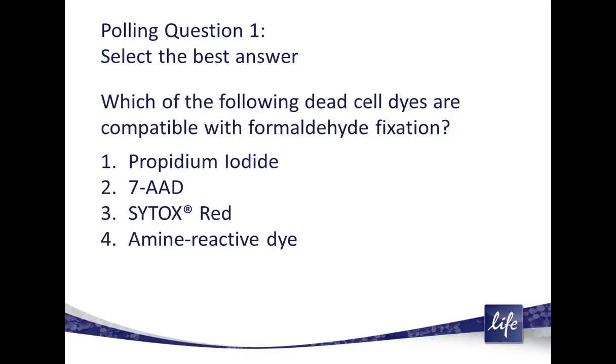So now we are at our polling question 1, and you can select your answer as soon as you are able to. The question is, which of the following dead cell dyes are compatible with formaldehyde fixation? The selections are 1, propidium iodide, 2, 7-AAD, 3, SYTOX Red, and 4, an amine reactive dye.